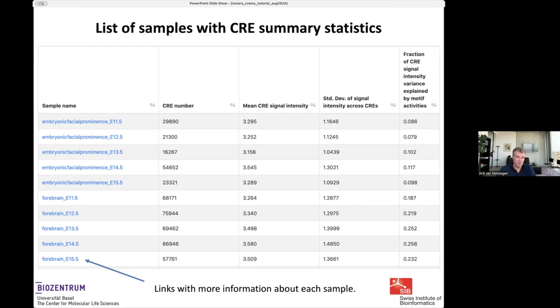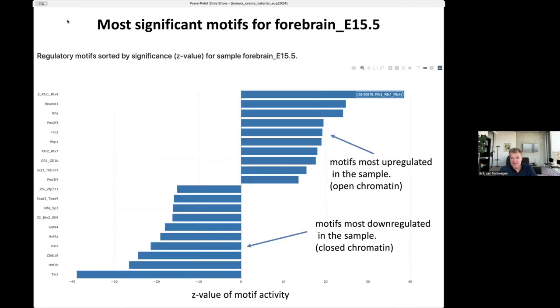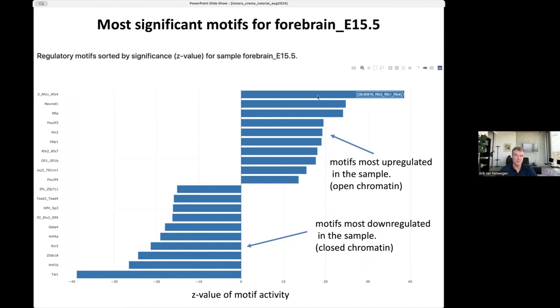You can click further to get additional information about the CRUNCH results — mapping quality, noise characteristics, and more. For each sample, you also get a summary of the most significantly up- and downregulated motifs. For example, for forebrain at embryonic day 15.5, the most upregulated motif was RFX, NeuroD1, NFIA — with RFX almost 38 standard deviations upregulated — while the most downregulated was TAL1 at almost 40 standard deviations down.